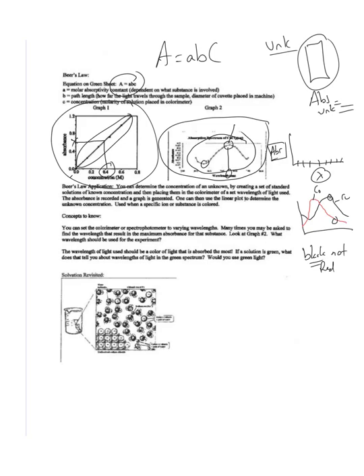You'd want to pick the wavelength of light that maximizes the one that you want to absorb and minimizes any of the other substances that you do not want to affect the outcome of the substance you're trying to analyze. Okay, so these are two different graphs you might see. The first one is the Beer's law graph, where you vary the concentration. The second one is determining what wavelength of light you should utilize for the experiment. So actually graph 2 would be the first one you would do. And once you figure out the wavelength, you'd keep that wavelength at a set value and now vary different solution concentrations in the machine and get your Beer's law graph.